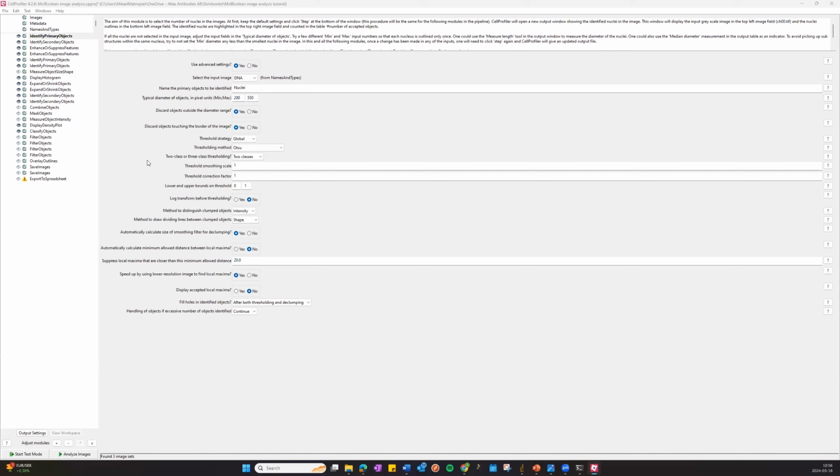The MolBoolean image analysis pipeline is composed of a series of modules that will ultimately segment and quantify the number of RCPs with fluorescent signal in the Atto565 or the Atto647 channels. The modules are preloaded with default settings. However, these settings may have to be altered slightly based on the image parameters of your experiment. CellProfiler permits the testing of your settings in test mode before performing the final image analysis. So in test mode, you can adjust some of the settings so that they suit your images before you actually do the final image analysis. And I will walk you through these settings now.